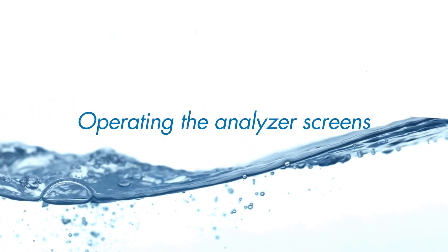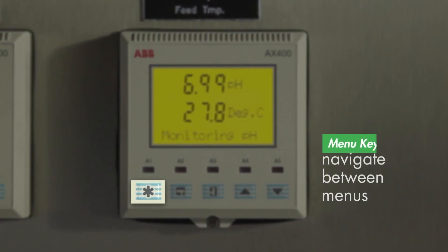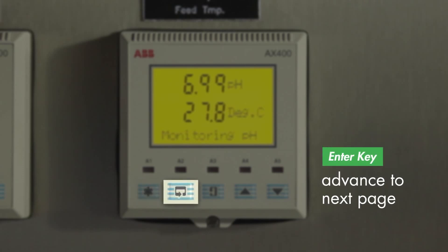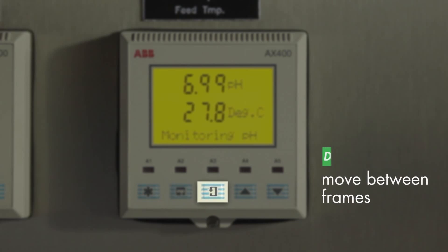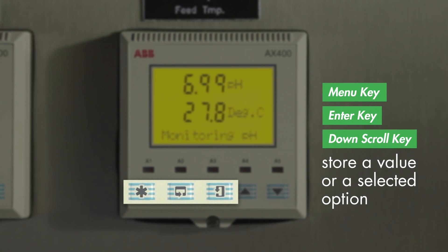Before we begin, a short reminder on how to operate the analyzer screen. Press the menu key to navigate between menus. Press the enter key to advance to the next page. Press the down scroll key to move between frames. Press the up and down keys to adjust values or to select options. To store a value or a selected option, press any of these three keys.